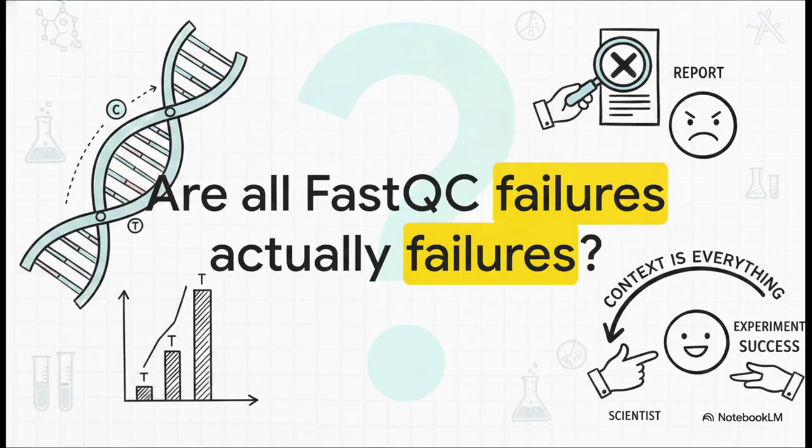Say you're running a specific chemistry test called bisulfite sequencing, which intentionally converts the DNA letter C into a T to study how genes are controlled. Your FastQC report is going to show a terrifying massive loss of the letter C and flag it as a catastrophic failure. But for you, it's proof your chemical experiment actually worked perfectly. Context is literally everything here.